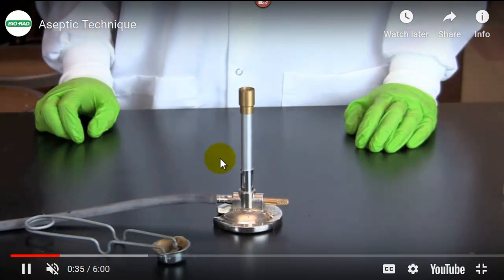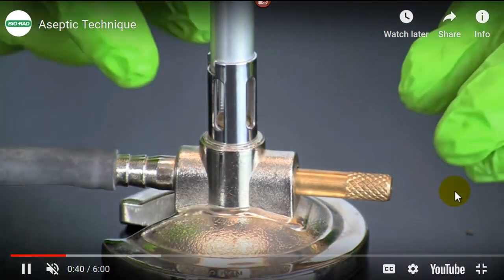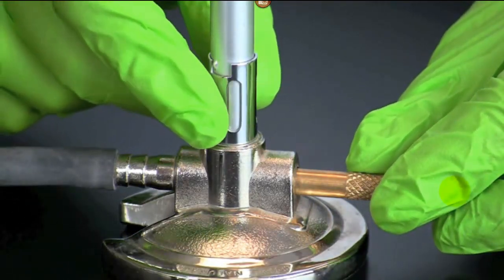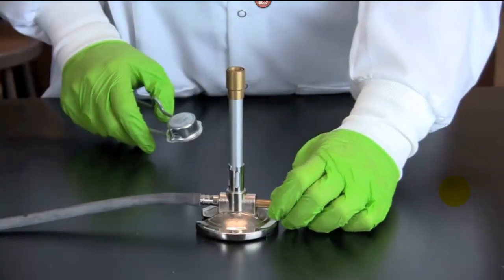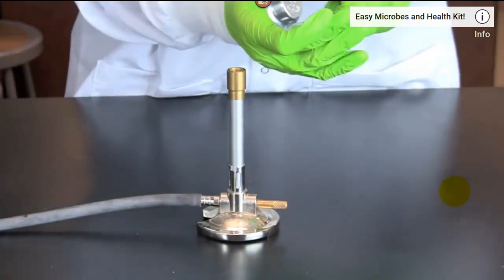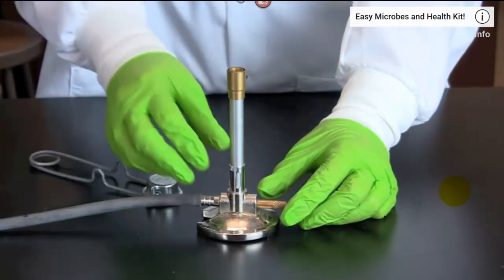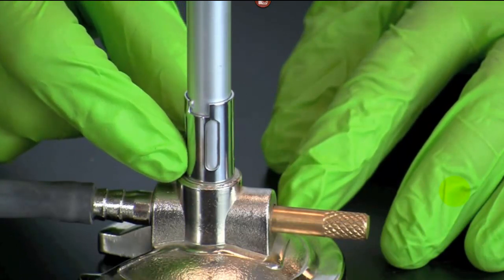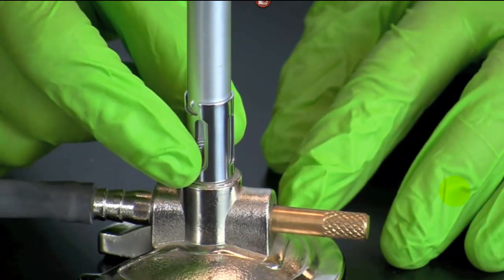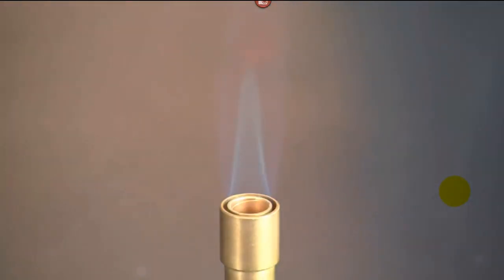Here is a Bunsen burner. There's a lighter, and ours are similar to that. We have a canister, so this person controls how much oxygen is going to the flame. In essence, how strong do you want the flame, or how high up do you want it to go? So he's going to light it, and it looks like he did. I can barely see that. Okay, well, he's now adjusting how much air, slowly and dramatically. There it is. You have a nice little cone. See the blue cone inside?